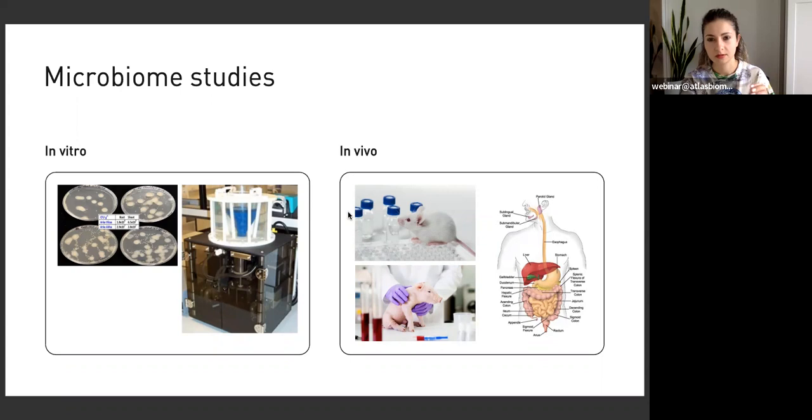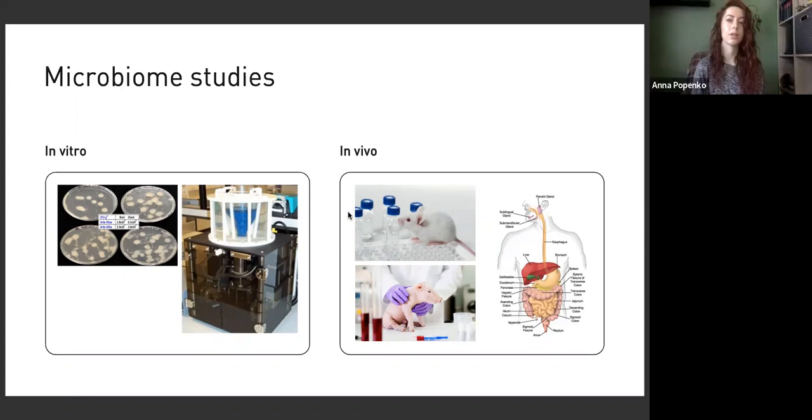It can be even more precise than analyzing one region of 16S as we do now. To compare with the whole 16S RNA gene, the precision would be more or less the same, I guess. But since we analyze only one region, which can be identical in some very close species, the whole genome sequencing will see the difference and identify two different species.